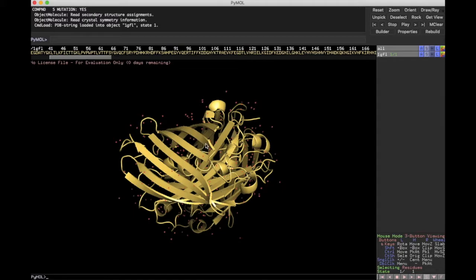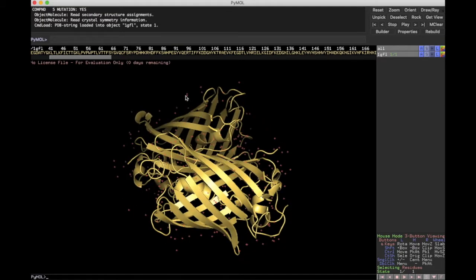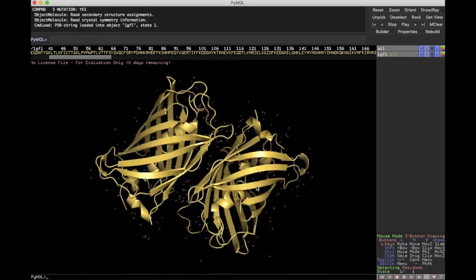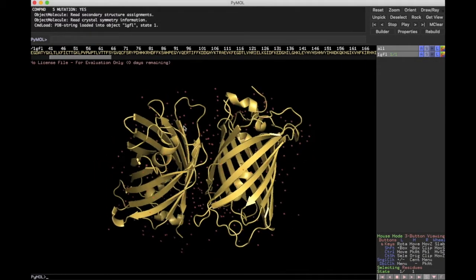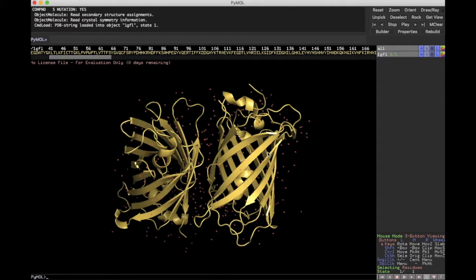Okay, so in this video, we're going to look at how we can mutate inside the protein. In the prior video, we changed an amino acid on the surface of the protein, and this time we're going to go inside of the protein.